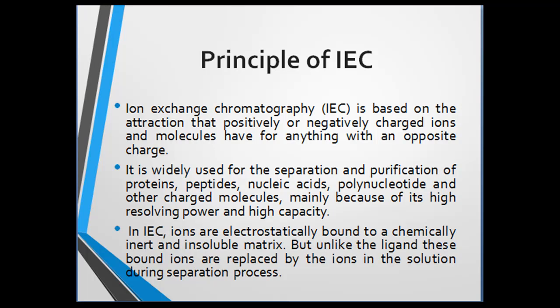But unlike a ligand, these bound ions are replaced by ions in the solution during the separation process in the following manner: M+A- plus C- gives M+C- plus A-.